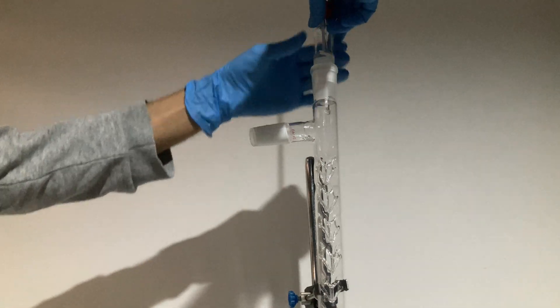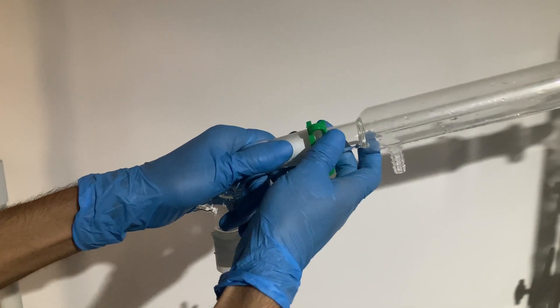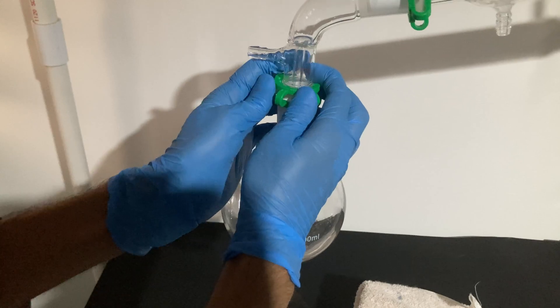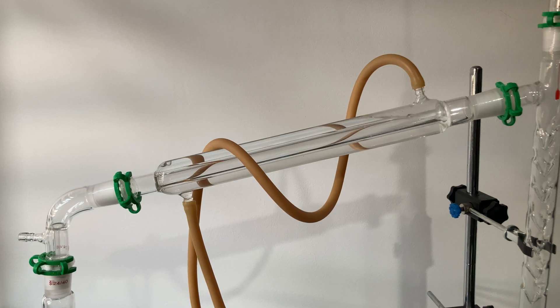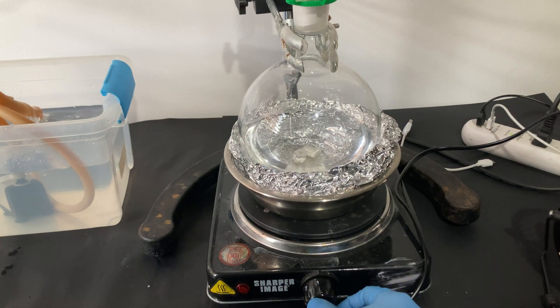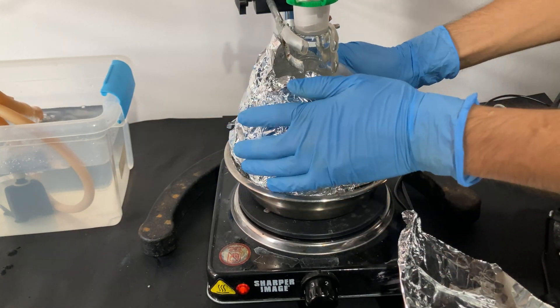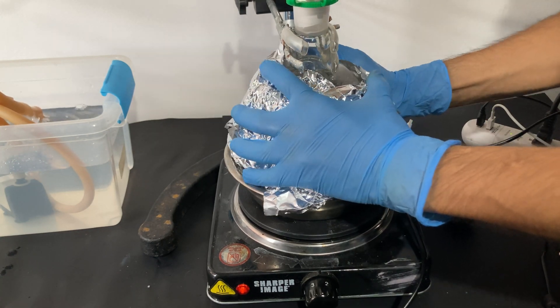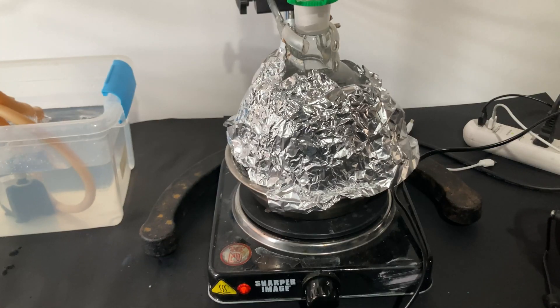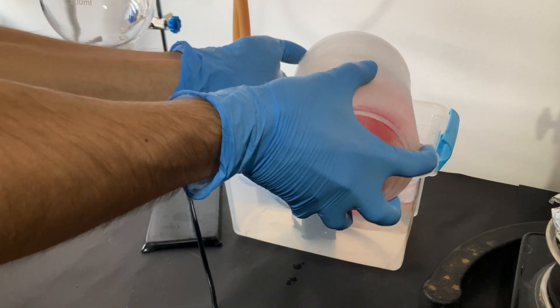In normal, or simple, distillation, the aim is to evaporate one component of the mixture, then condense and recover it. However, this can be challenging, as in most cases both components evaporate at the same time, just at different rates. So the vapor phase contains more of one component, but is not 100% pure. This can be overcome by distilling the mixture again, increasing the concentration of the more volatile component. In theory, you could repeat this distillation infinitely to achieve purity. However, in the real world we are limited to a finite number of distillations - though that is enough for many mixtures, so you don't have to distill it infinitely. Several times are good enough.